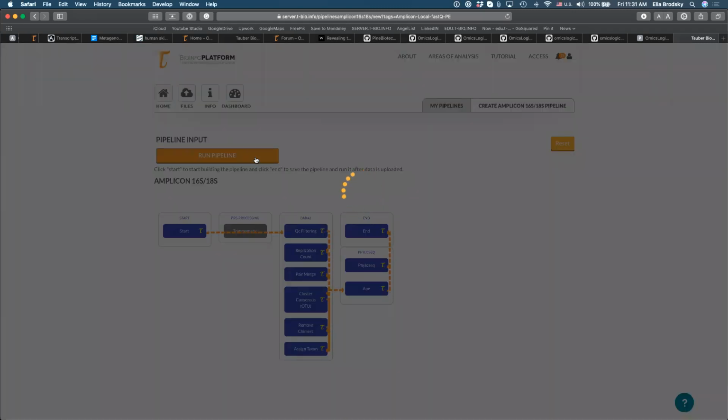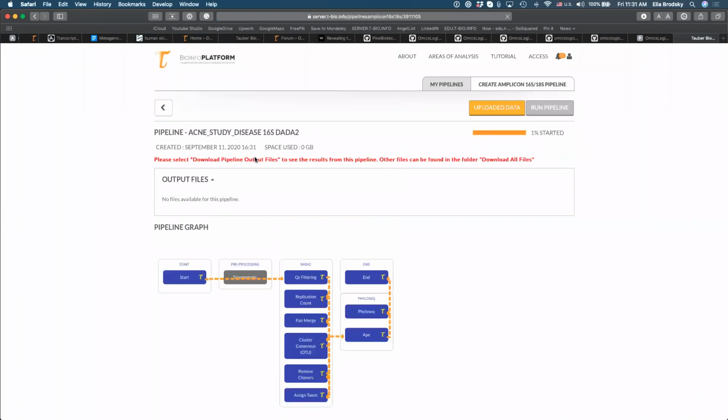Okay, we're already over time. Unfortunately, I did want to show you how to run the phyloseq methods in R, but instead of taking up the time, maybe we'll have some time to do it in our next session, or we will just send you a direct link to the lesson on the code OmicsLogic.com, so you can explore that. And we'll try this with a couple of different data sets that we can look at, including this acne data set.